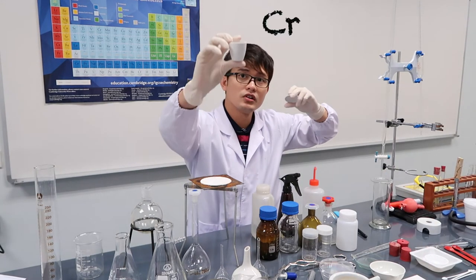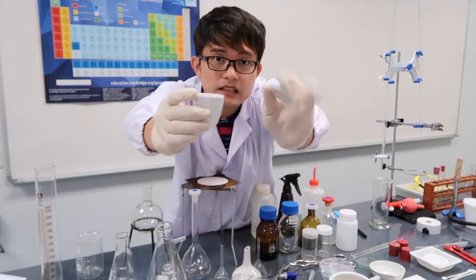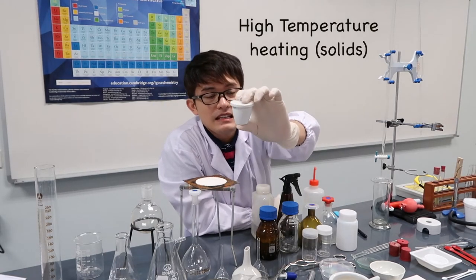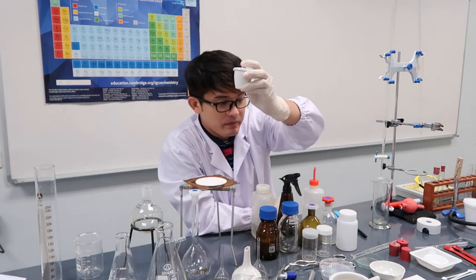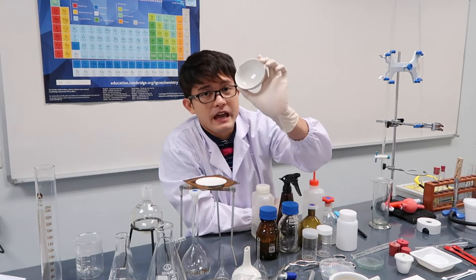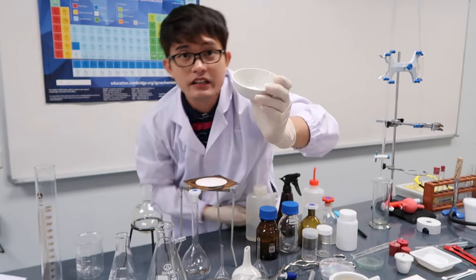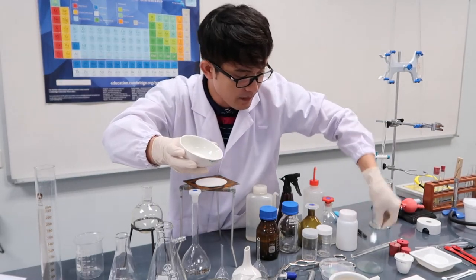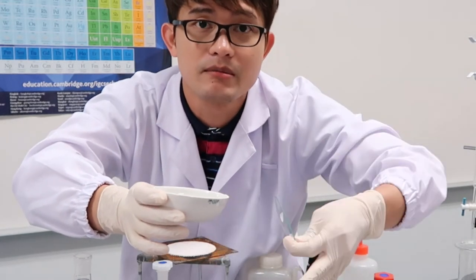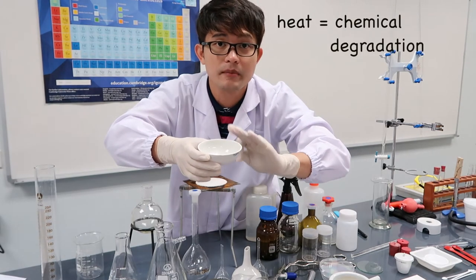This is a crucible cup, and this is a crucible lid — they go together. The crucible is used for extreme heating of solid materials. For liquids, if you want to evaporate a liquid, we use the evaporating dish. The difference from the watch glass is that the evaporating dish can be heated directly to evaporate faster, whereas the watch glass is for air drying.